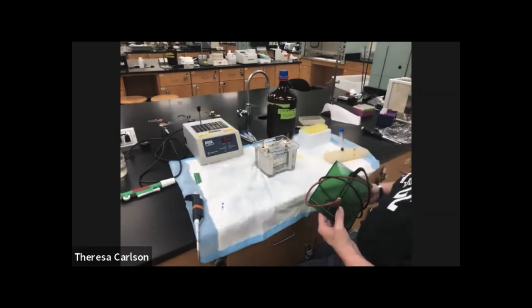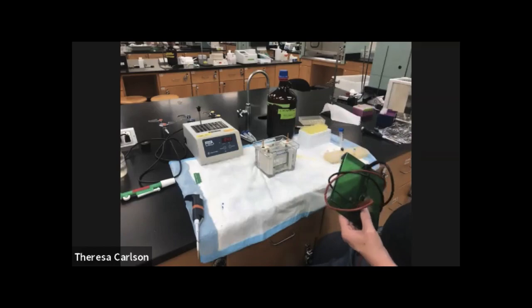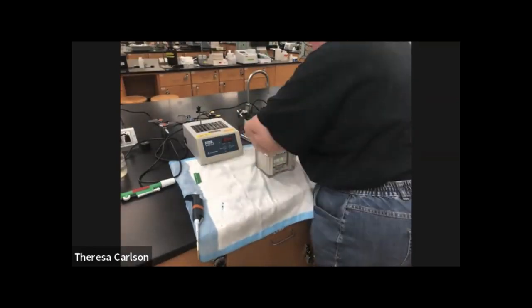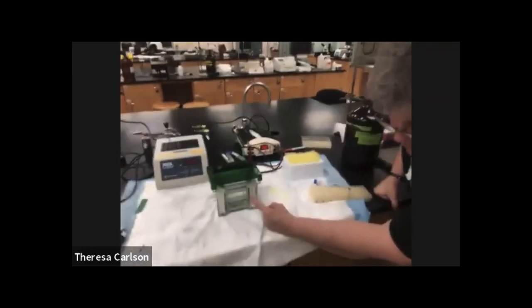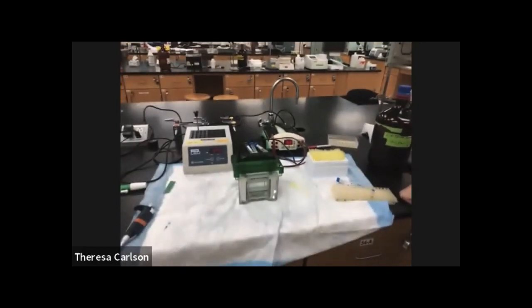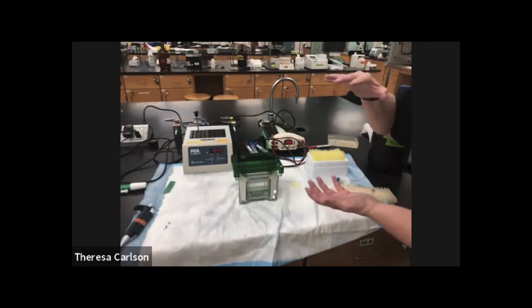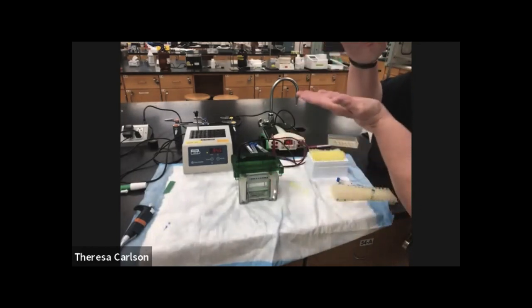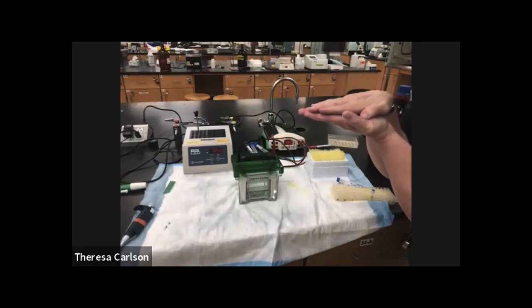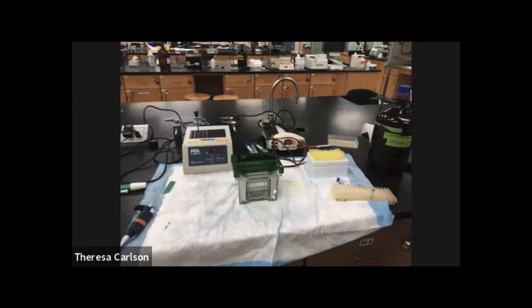So the next step is to hook it up to a power supply and start running the gel. And now you will see bubbles coming up from your gel, and that will tell you that it's actually running. What you will see is the lanes, because remember we loaded different amounts in the lanes, so the volume in the lanes will start to squish down until they're in a tiny, tiny single band as they move through the stacking gel. That's why it's called the stacking gel.